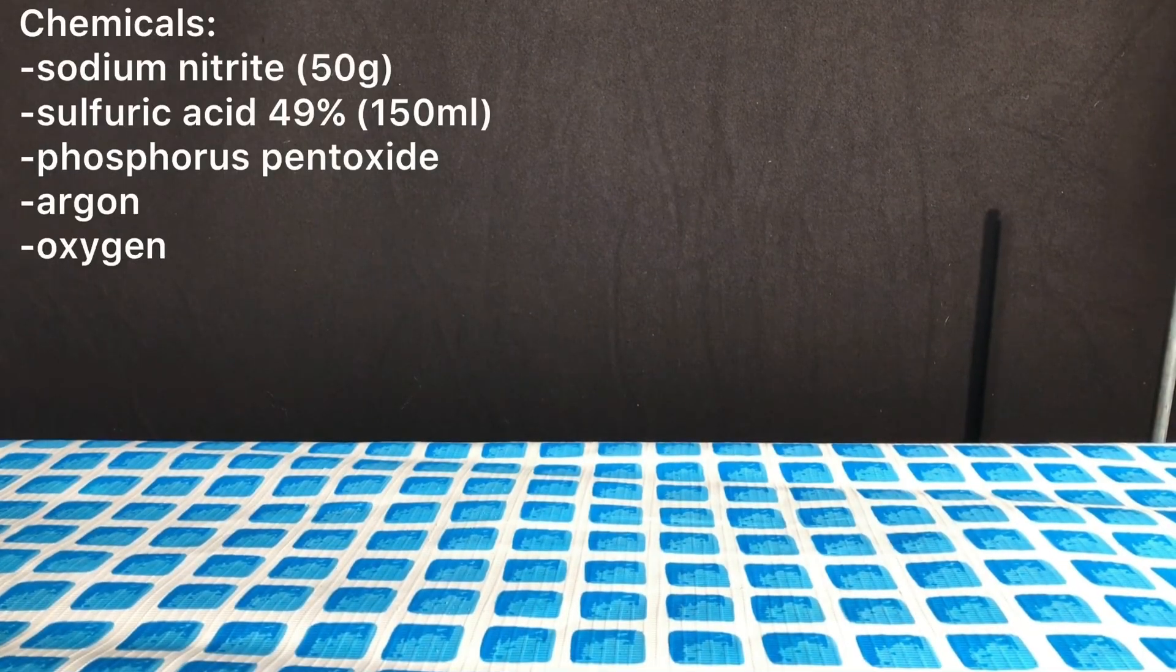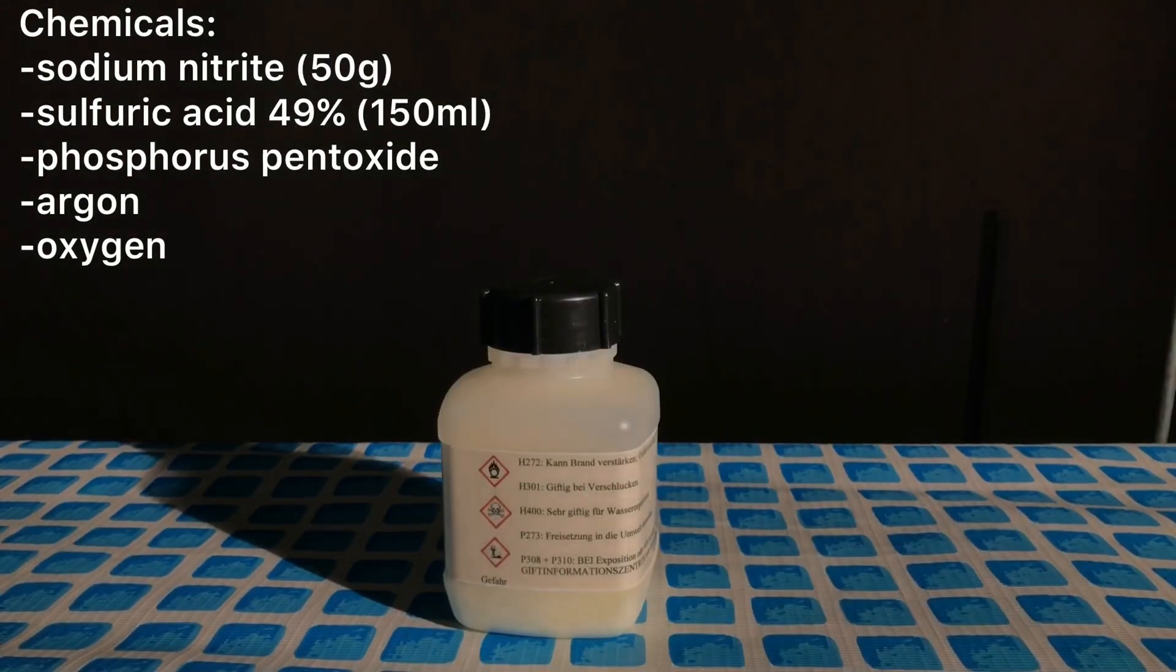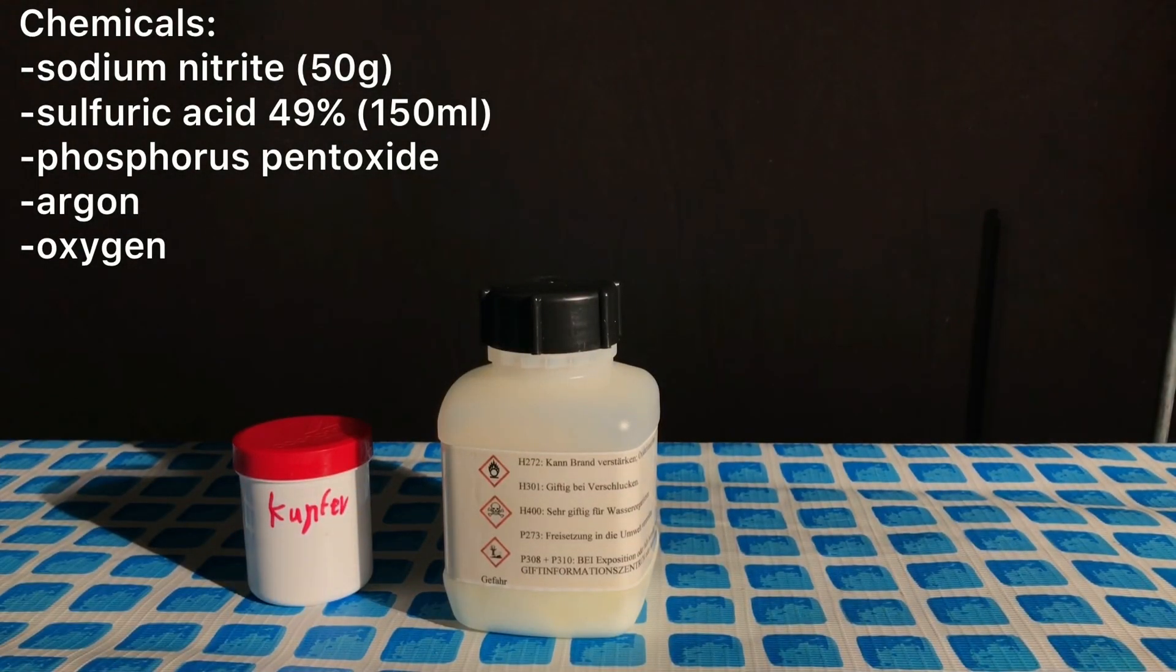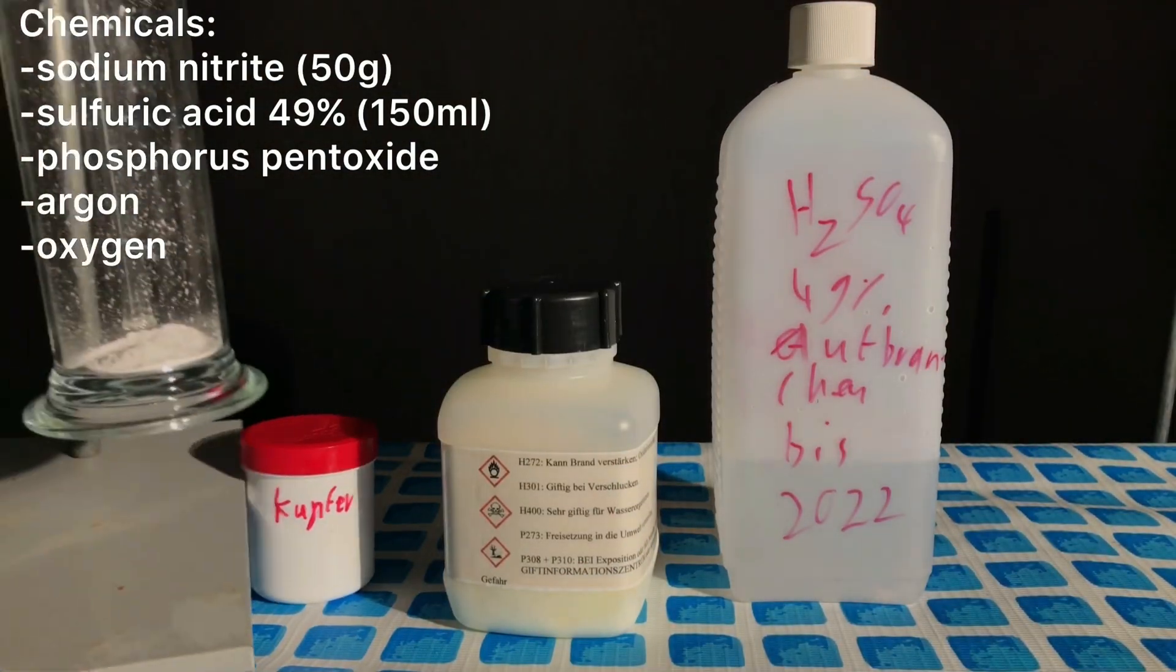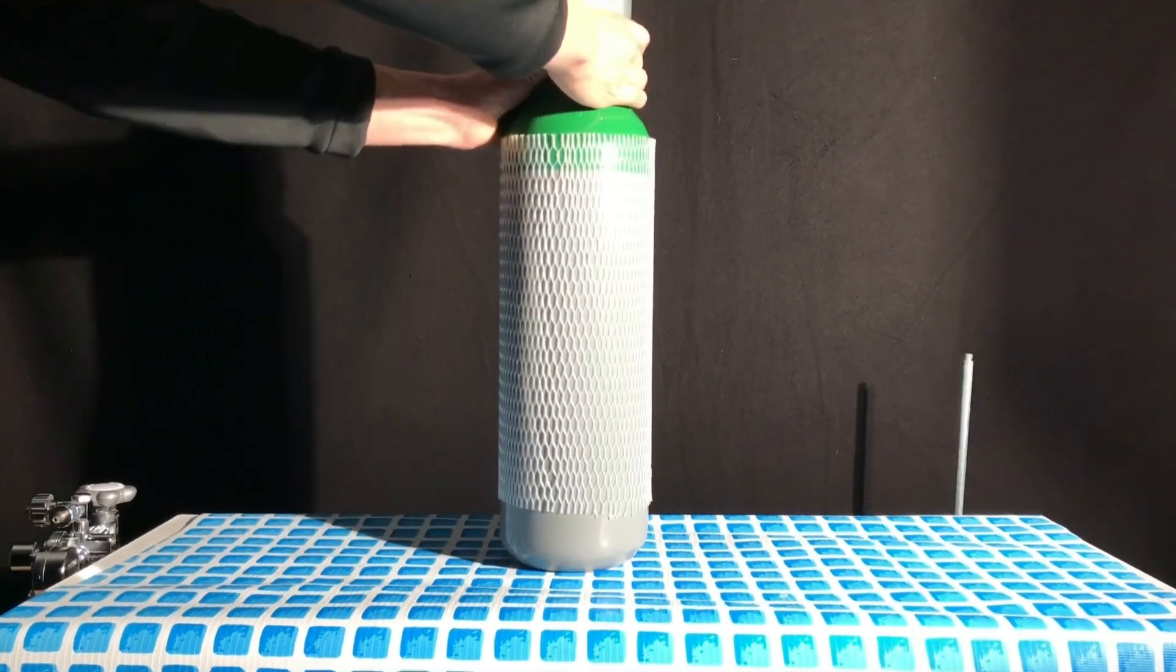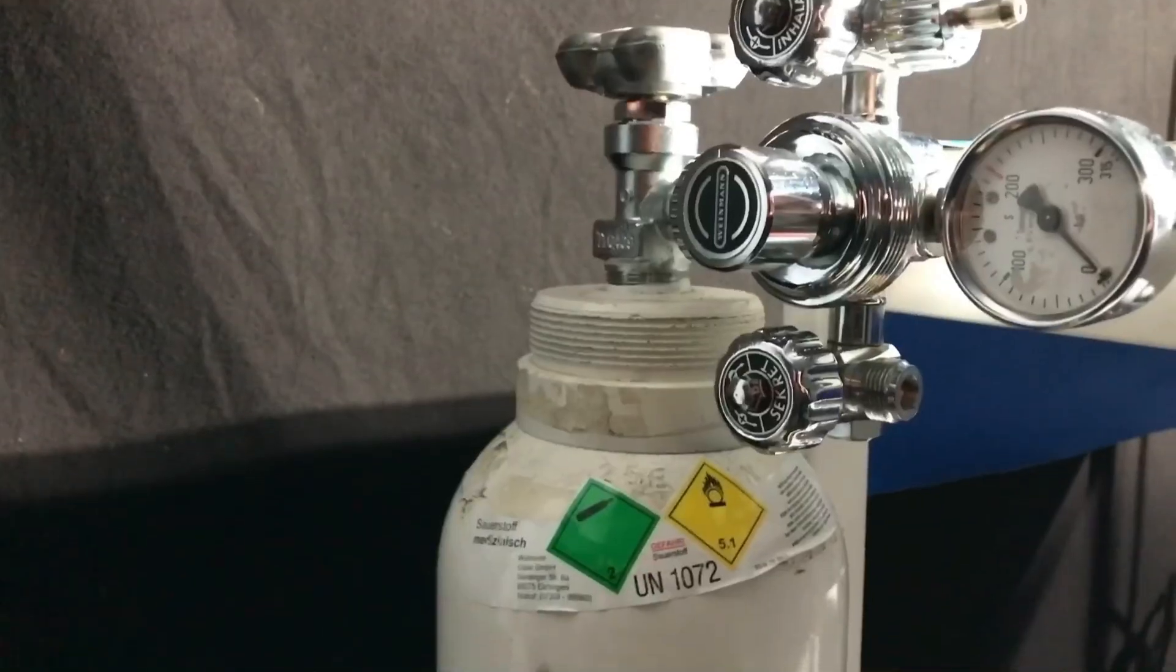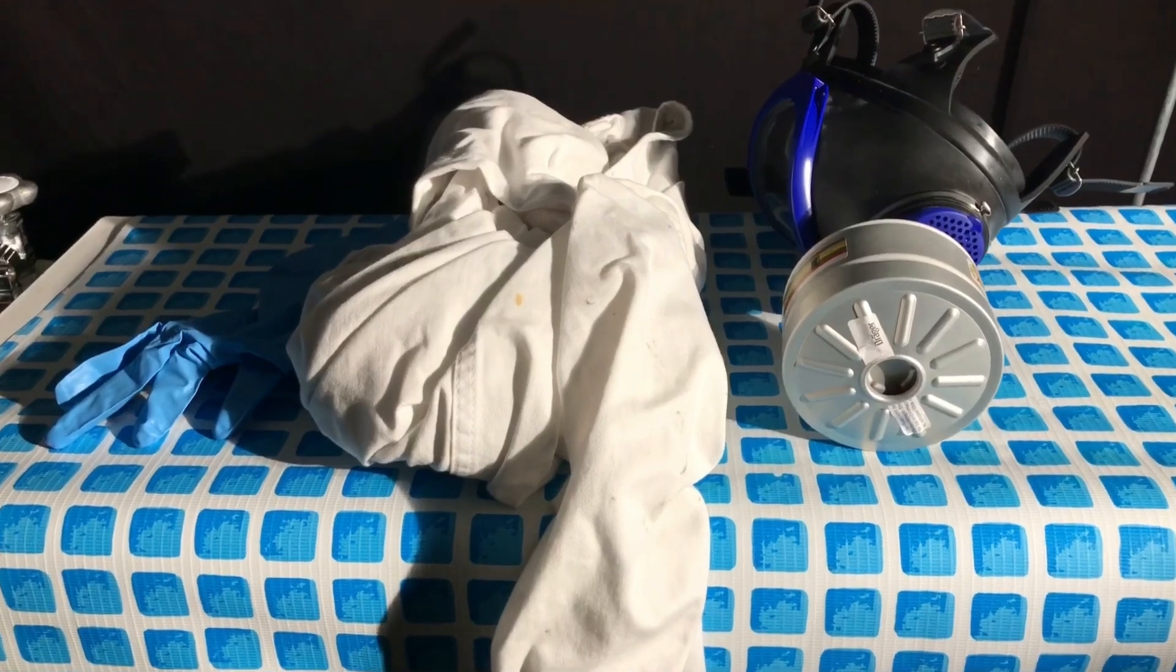For this preparation, 50 grams of sodium nitrite, 150 milliliters of 49% sulfuric acid, which represents a huge excess of sulfuric acid, phosphorus pentoxide, argon and oxygen are needed. The argon will be used to create an inert atmosphere in the beginning. This ensures dinitrogen trioxide formation. The oxygen will be used to oxidize that further to nitrogen dioxide.